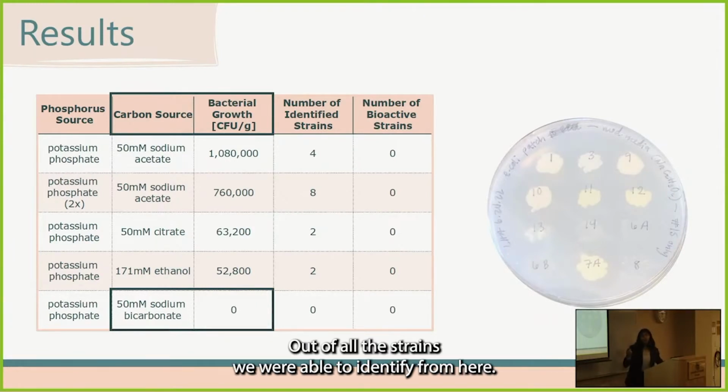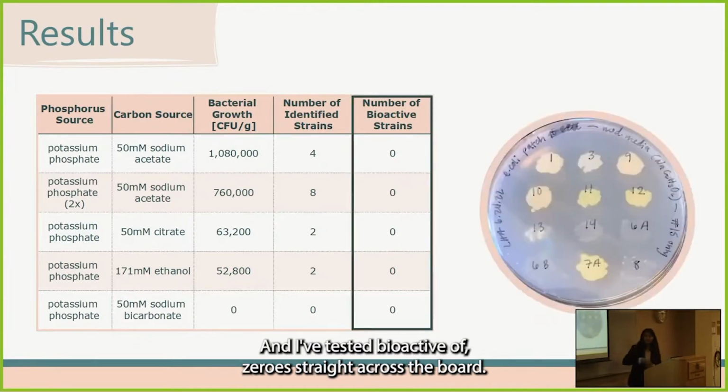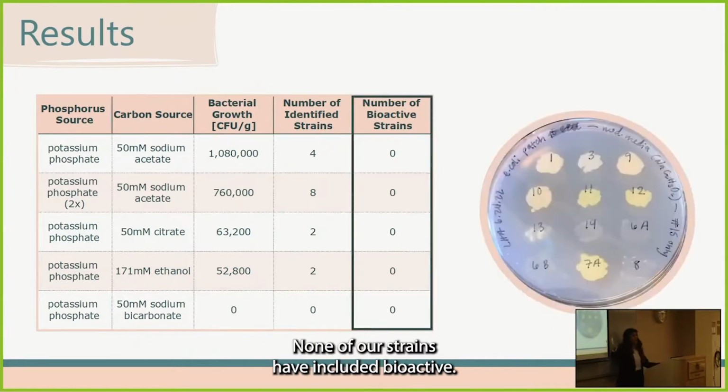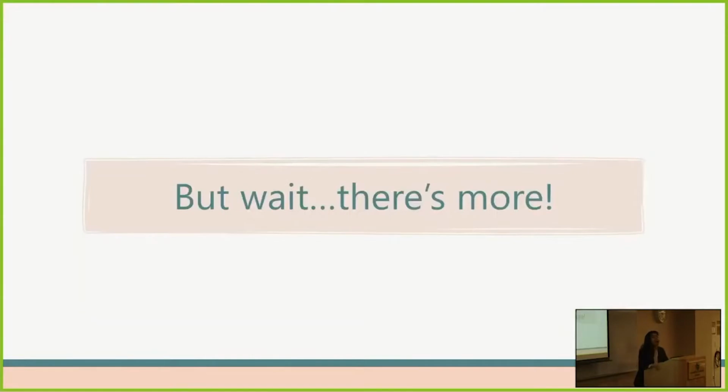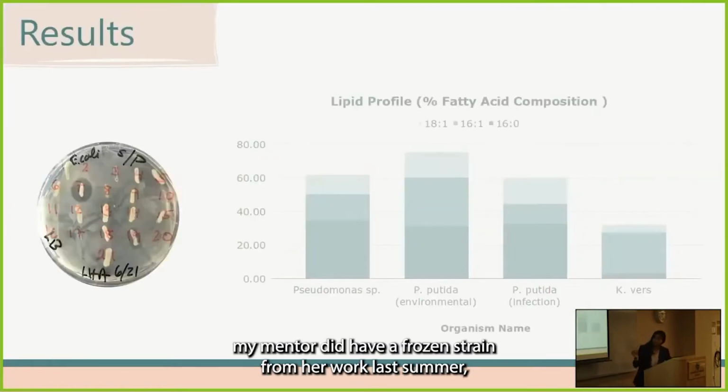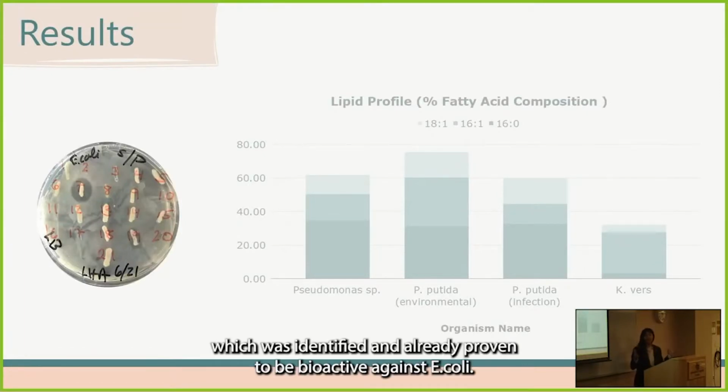Out of all the strains we were able to identify from here and test the bioactivity of, 0s, straight across the board. None of our strains happened to be bioactive against E. coli. And this was certainly disappointing. However, my mentor did have a frozen strain from her work last summer, which was identified and already proven to be bioactive against E. coli.